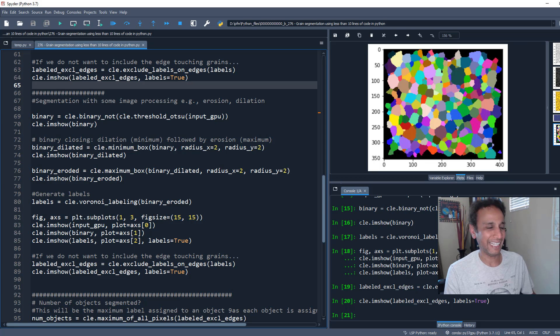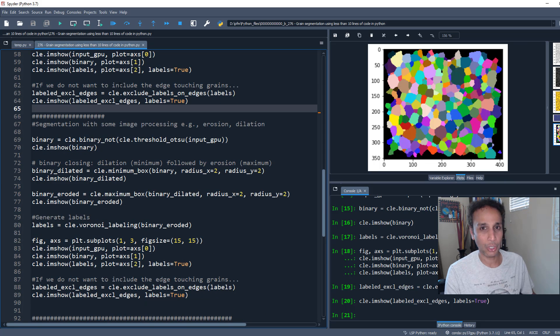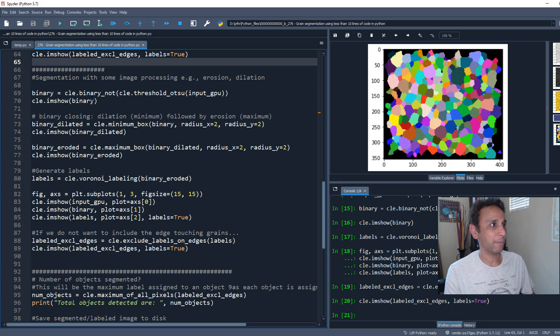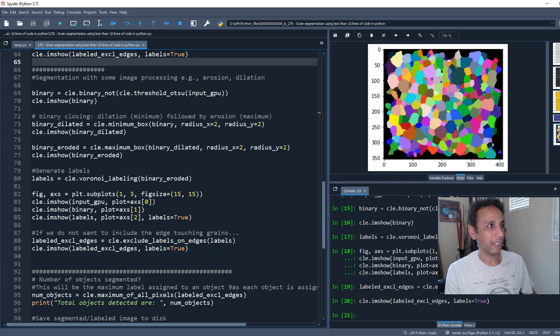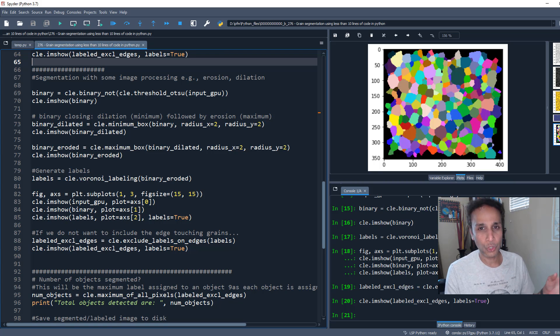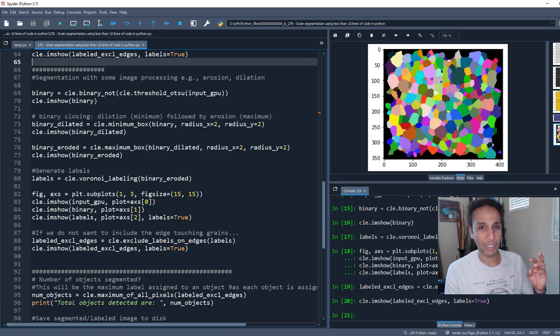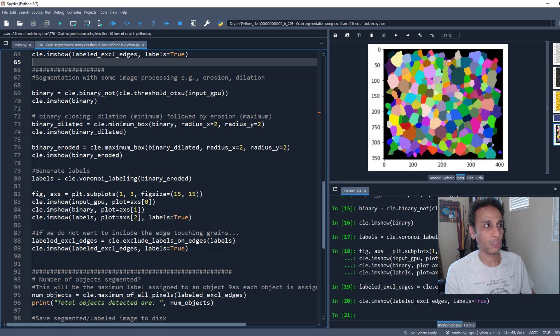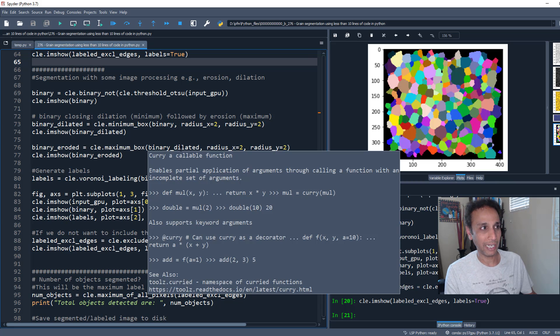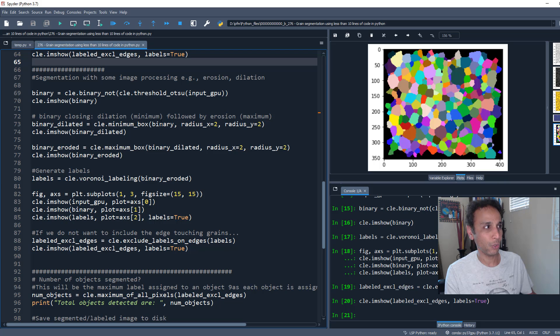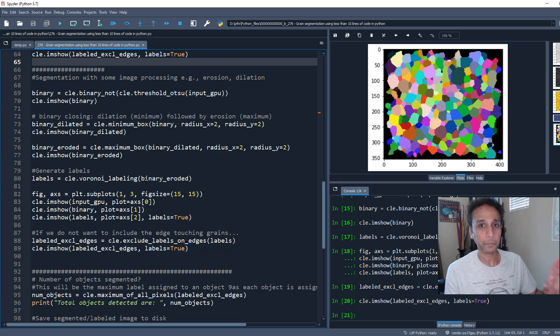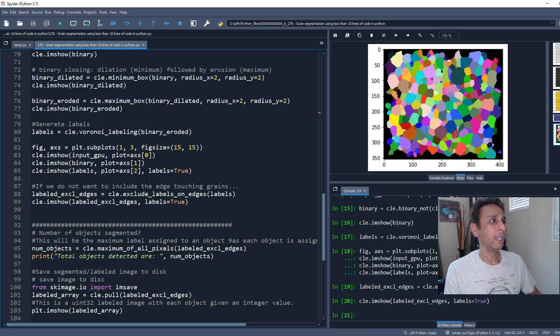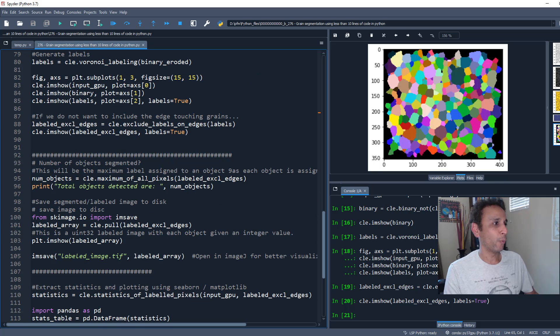I'm also adding this line of code for you. This is the same as what I showed, except here you can add a little bit of dilation and erosion of your grain boundaries in case you need to do that type of operation. That's why I'm leaving that here.